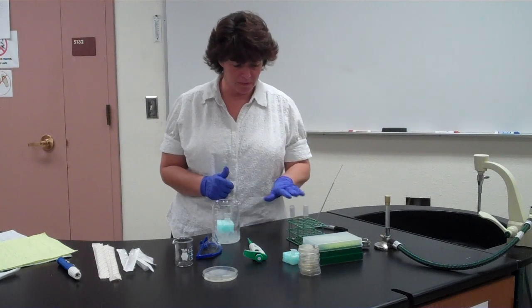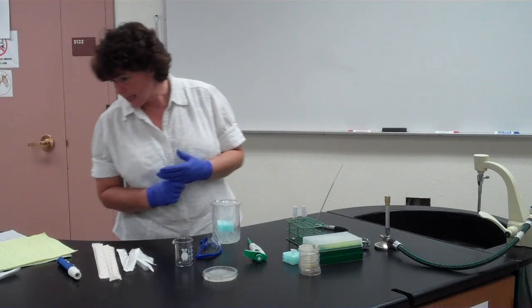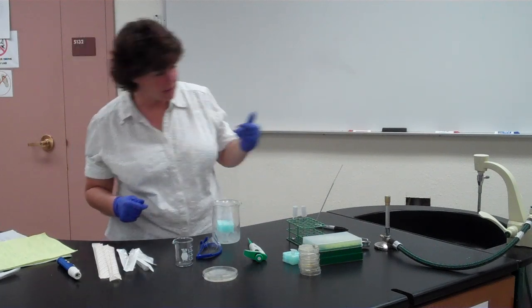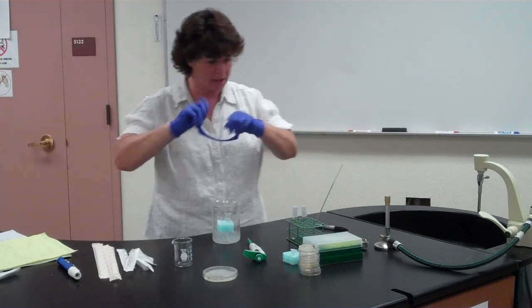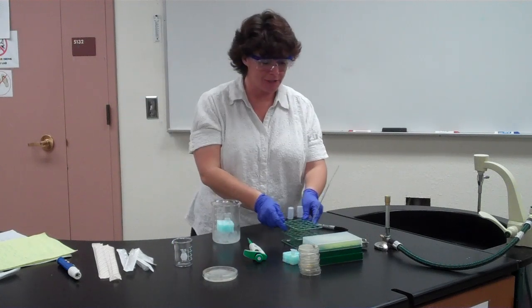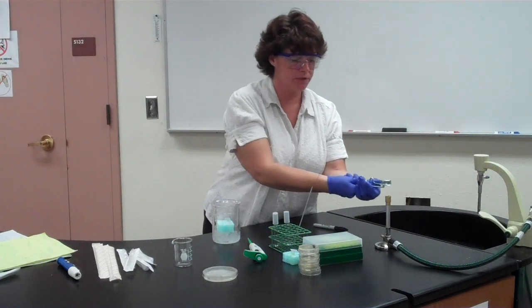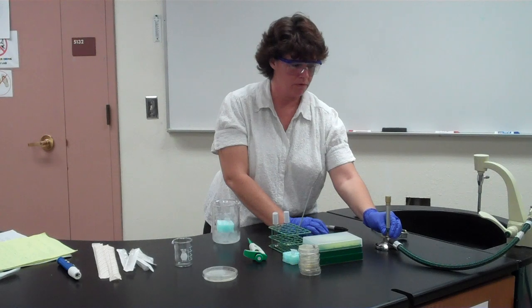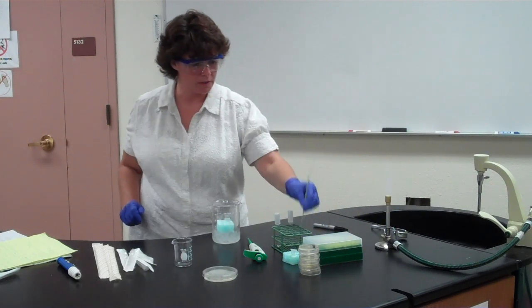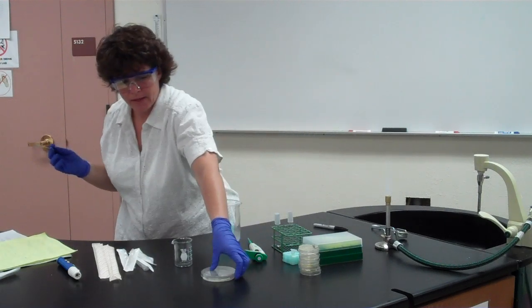So we're putting the exact same stuff in both of these tubes. The next thing that you're going to add is going to be the E. coli. So for this particular procedure, we're going to need our flame. It says you can use plastic sterile loops, but we're going to use our regular loops that we always use. Okay, and we need to flame it and use our sterile technique that we always use. Okay, we're going to let that cool off.